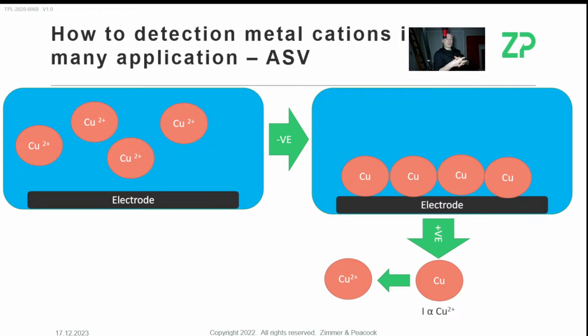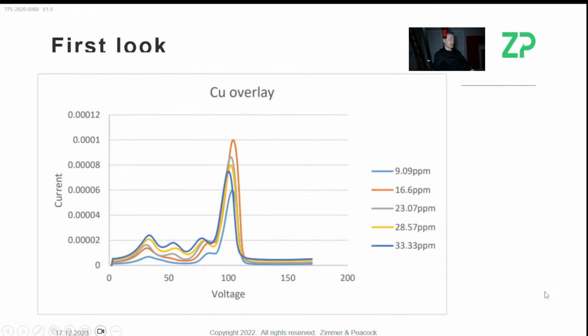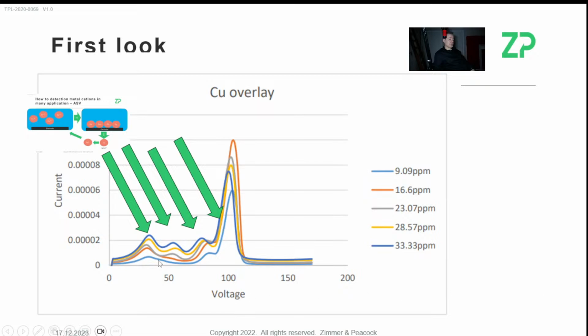And that works quite well for them as long as they're looking at what I labeled peak 1. By the time they get to peak 4, that simple relationship has broken down because they've already done 3 oxidations before they do peak 4. So I'm not super shocked that peak 4 is no longer linear, because you've got an oxidation here, an oxidation here, an oxidation here, an oxidation here.